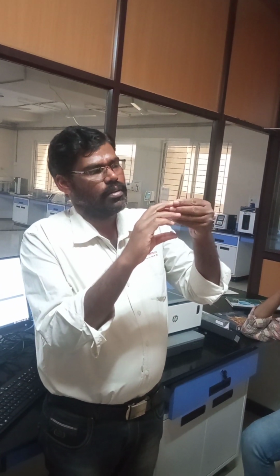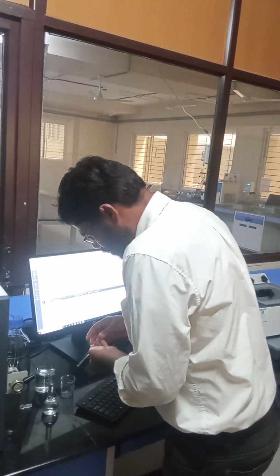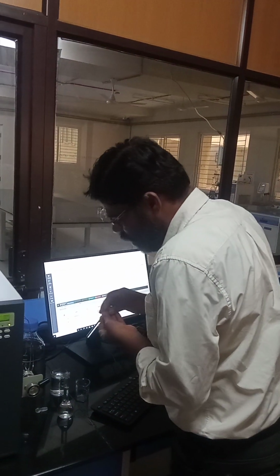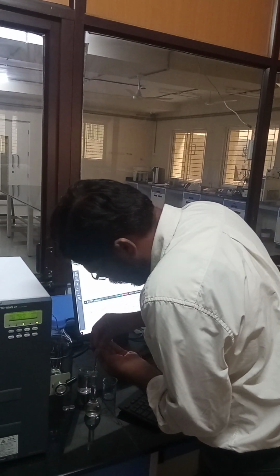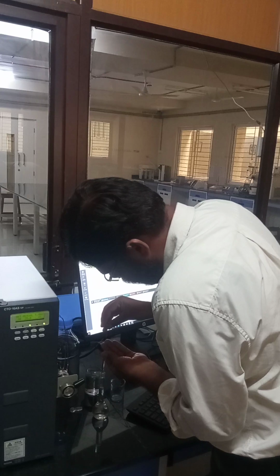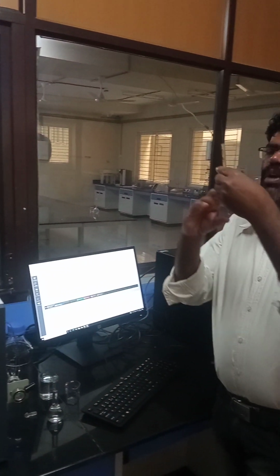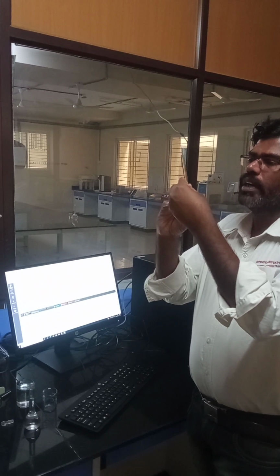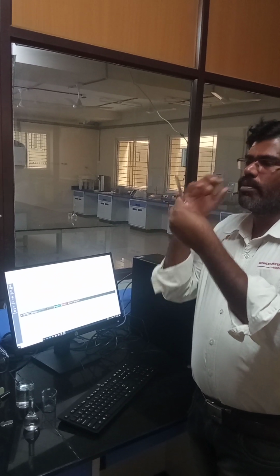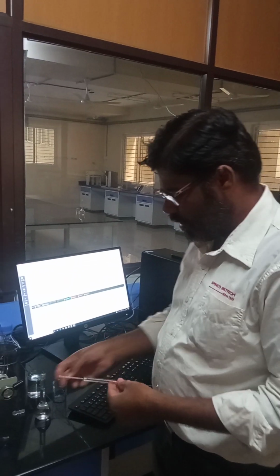Because if you inject 20 microliters, the peak area will get more. Actually, this totally depends upon the concentration of the sample. If any air bubble comes, push it once a little like this and it will go. Even if an air bubble is there, nothing will happen, it is a very small quantity.